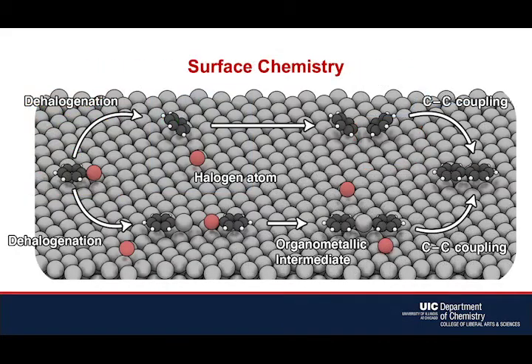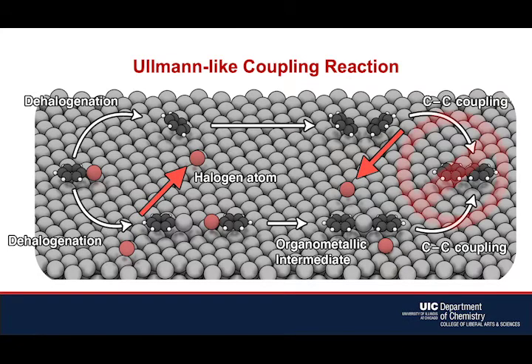When the interactions between molecules and a substrate are substantially strong, the surface can be used to catalyze chemical reactions. In the Ullmann-like coupling reaction, aromatic precursor molecules containing aryl halides undergo dehalogenative coupling reactions via thermal activation on a metal substrate, yielding atomically precise nanocarbon structures. Although a leaving group, the halogen atoms can remain adsorbed on the surface and are typically considered to be an undesirable byproduct that can poison the growth process of nanostructures. Here, I instead found that halogen atoms can form highly localized chemical environments, modifying molecule-substrate interactions to steer stereoselective reactions.